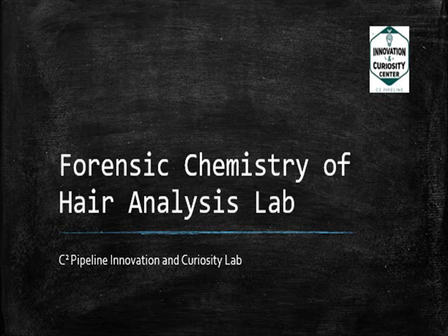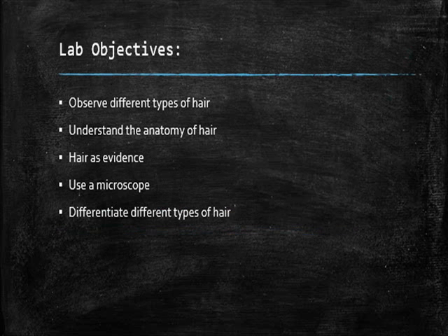Hello and welcome to the Forensic Chemistry of Hair Analysis Lab. By the end of this lab, you should be able to observe and identify different types of hair, understand the anatomy of hair, understand how hair can be used as evidence, be able to properly use a microscope, and be able to determine if a suspect's hair matches one found at a crime scene.